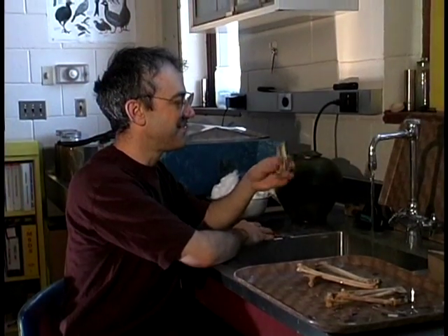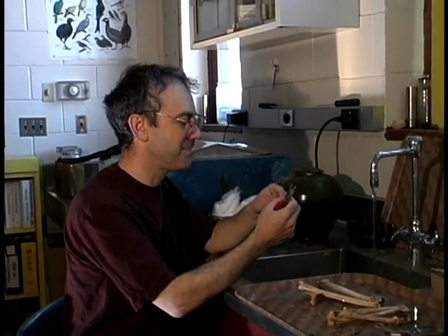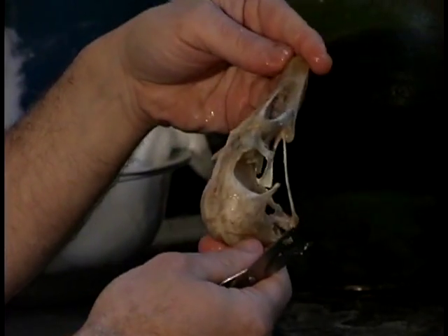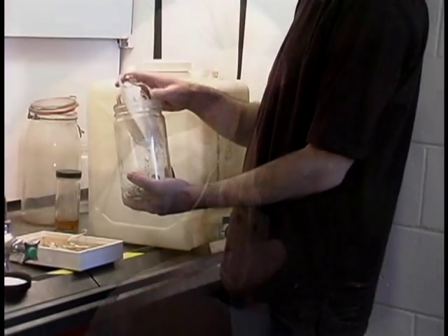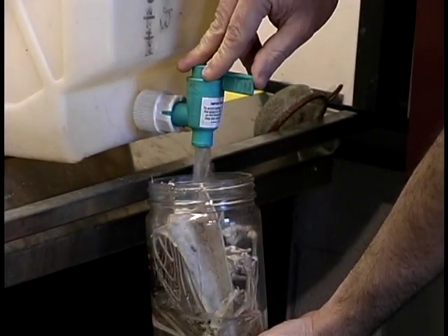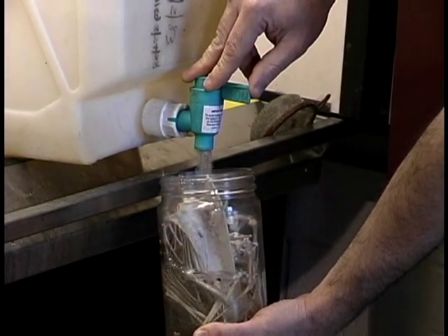Sometimes small bits of tissue are too hard or distasteful, even for these super cleaning machines, and humans must complete the job. For example, we have to degrease skeletons of fish or marine mammals in a weak ammonia solution, similar to what you might use to mop a kitchen floor.